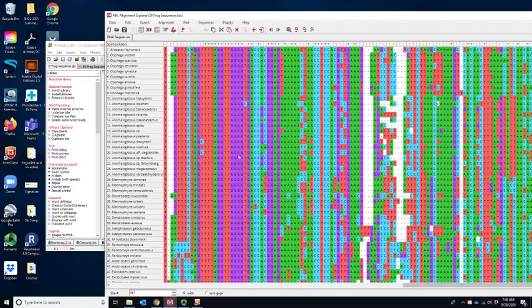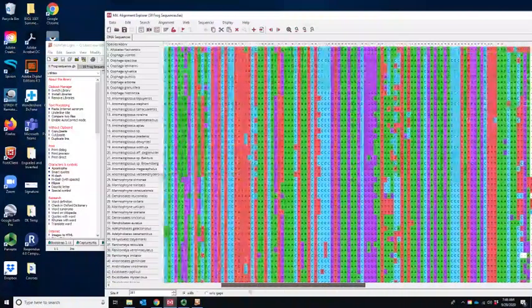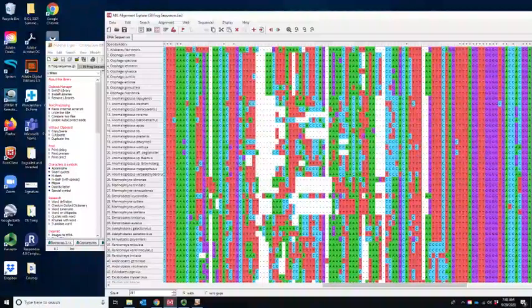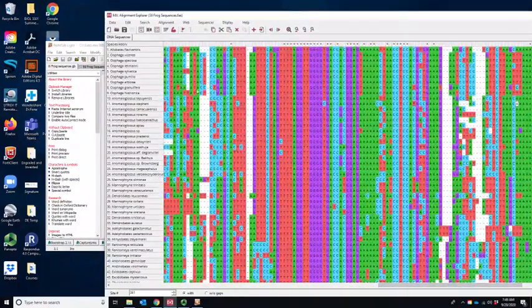And this is a 16S gene, so it's a ribosomal gene. It means it's non-protein coding. And ribosomal genes are interesting because they have these areas that are very, very conserved that makes alignment fairly simple for those regions. And then they have areas that are fairly diverse. And then they have these expansion regions which correspond to the loops in the three-dimensional shape of the ribosome. Overall, it makes them a pretty good gene to use because we have good alignment, but also diversity, and makes them a good gene to use for phylogenetics. Okay, so this is a fairly large data set. I put together 59 species here.